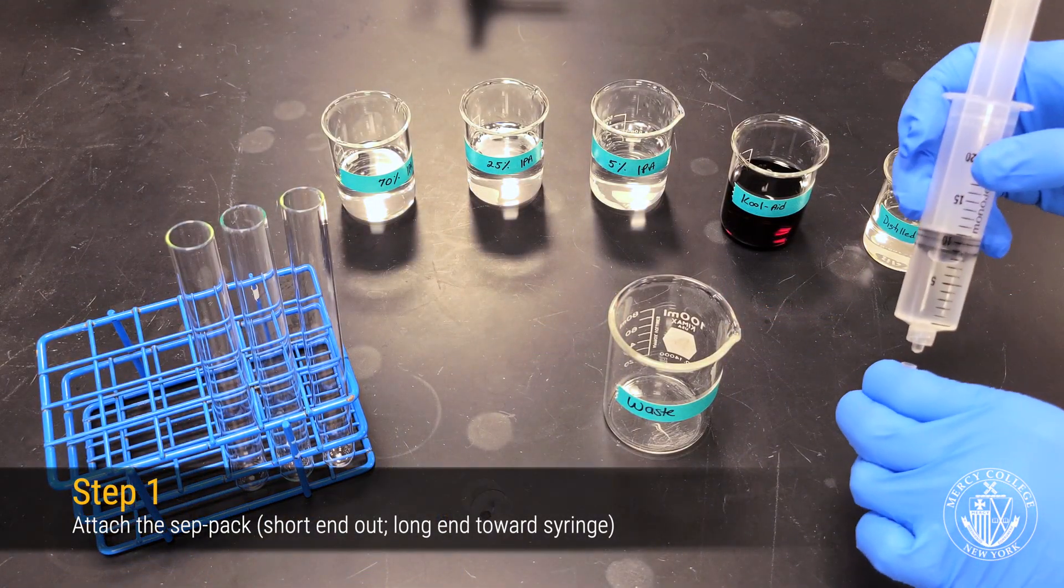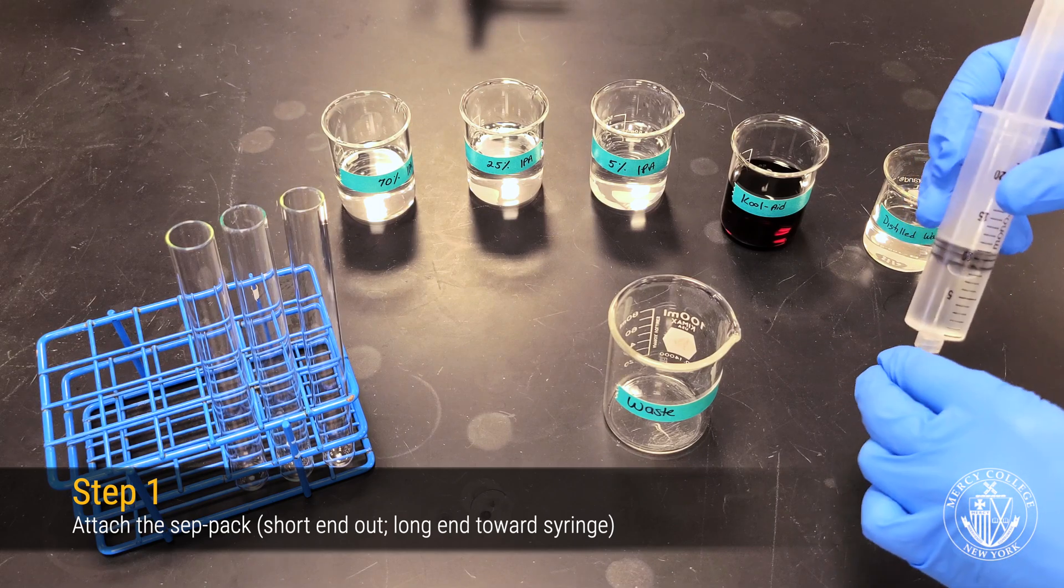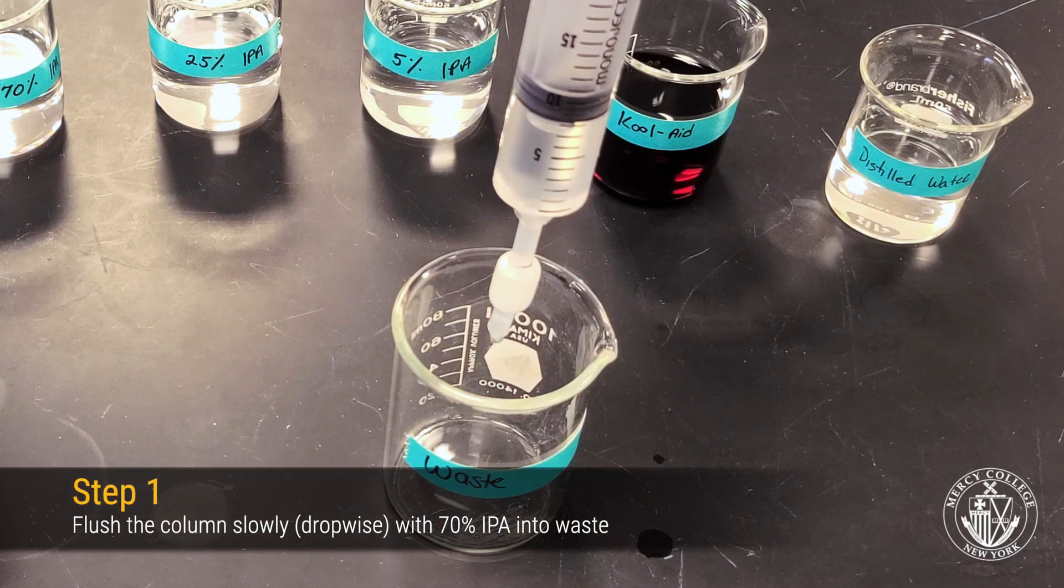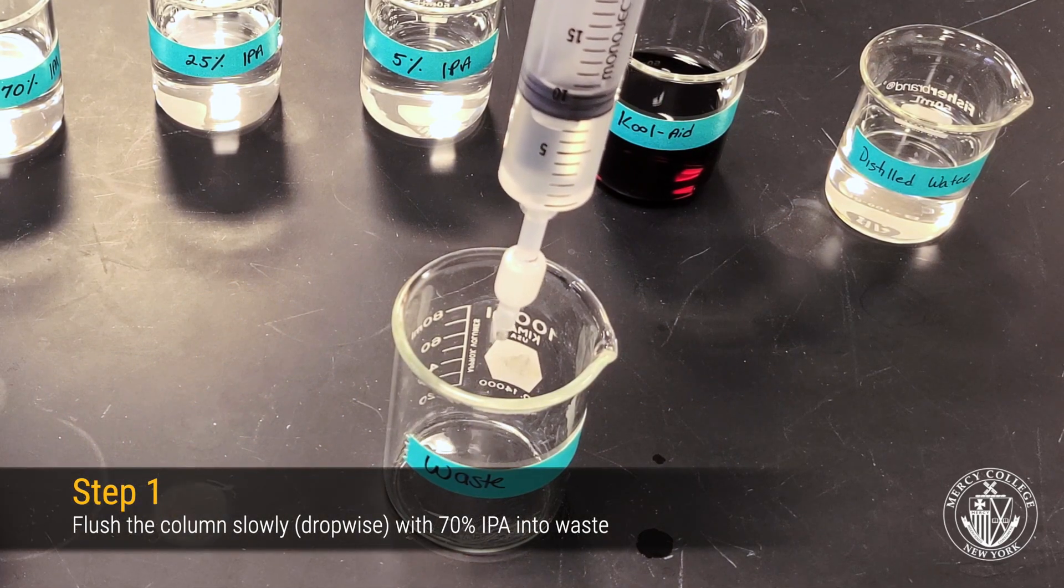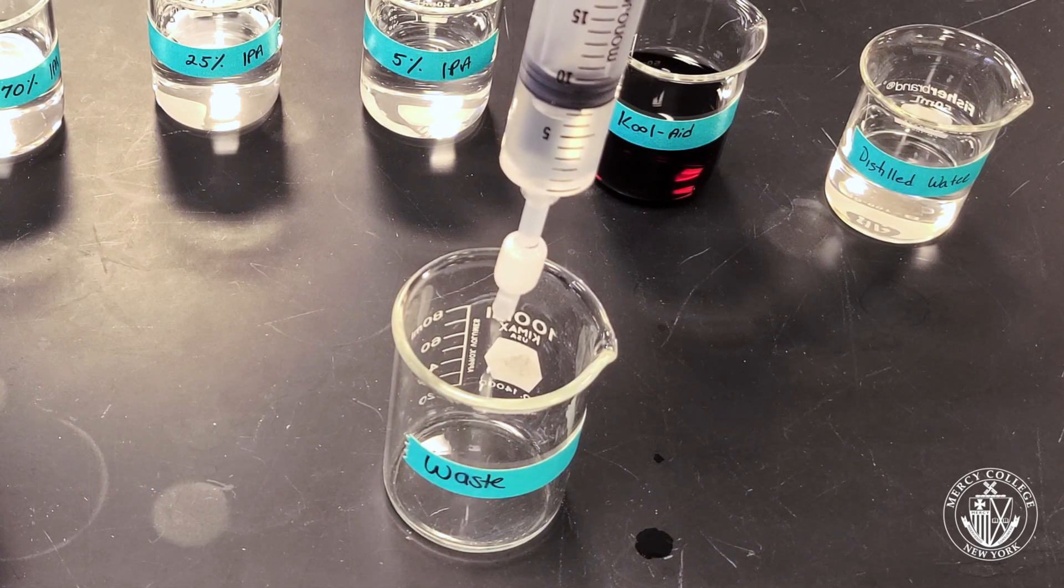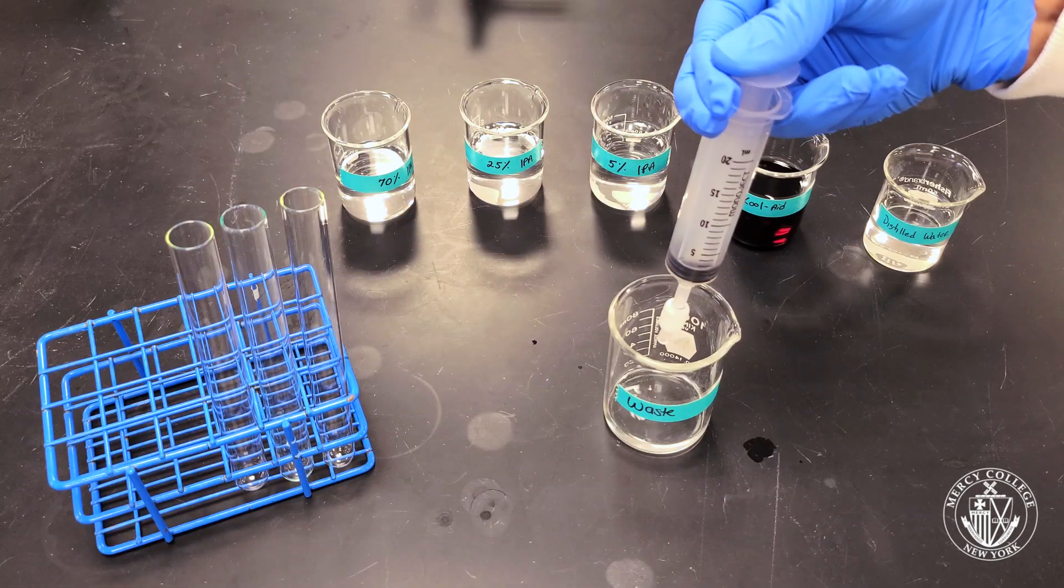Firmly secure the CEPPAC cartridge to the front of your syringe, making sure that the long side of the cartridge is pointed toward the syringe. Now slowly push the 70% IPA through the CEPPAC column drop-wise. Go slowly and avoid applying too much pressure so that you don't damage the column.